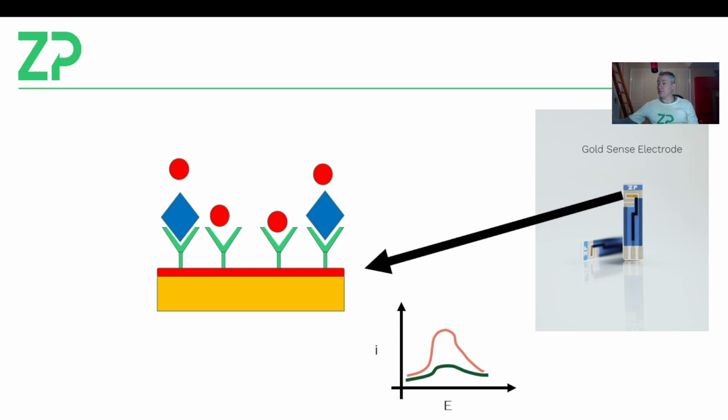You do have a signal, but you're probably, I don't want to say getting away with it, because you've actually got 1 microgram per milliliter, which is actually quite a large amount of analyte, especially for immunosensors. People are very interested in quite low concentrations, nanograms and picograms of this kind of material. So micrograms seems quite high.